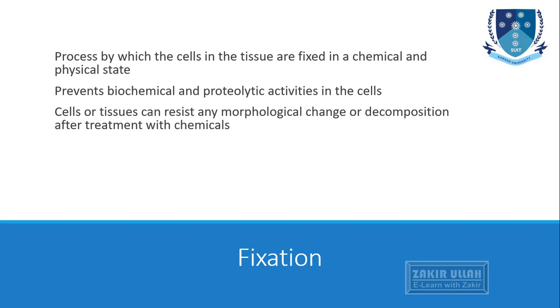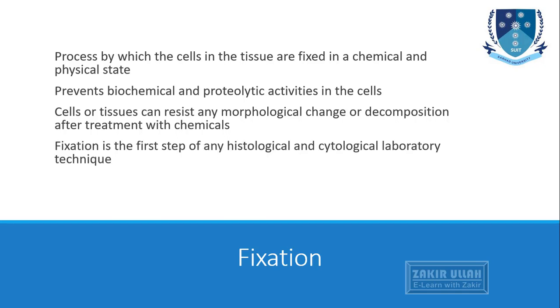As we know that in the near future, we will mix and add different types of chemicals, and we will stain such tissues with different types of dyes. So during this process, the cells or the tissue may change their morphology, or they may start autolysis, they may start decomposition. To stop all these processes, we will fix the tissues in a fixative, a chemical substance which maintains all the structural components of the cells. So for this purpose, we need a fixative.